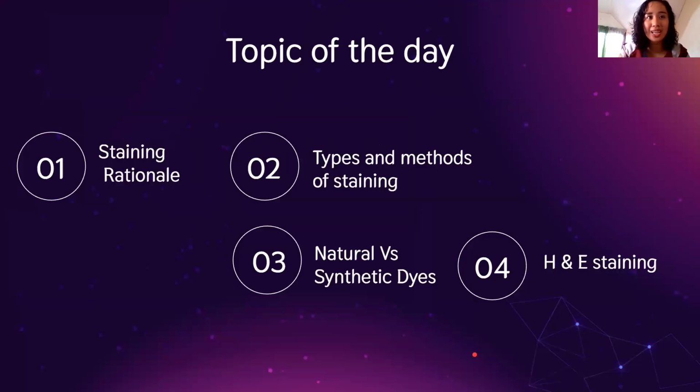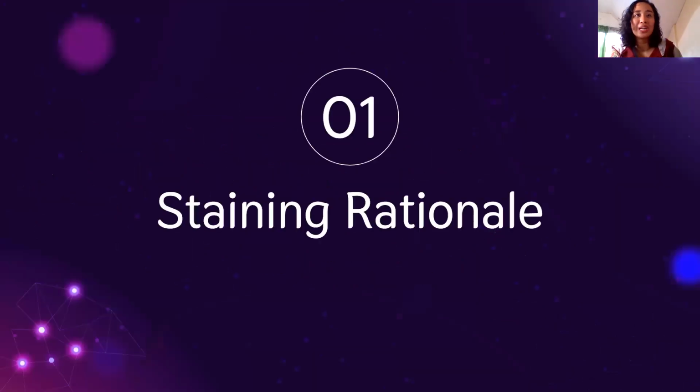So, let's brace ourselves. What is the reason for staining? Why does a tissue stain? What are the staining mechanisms, types and methods of staining, different types of dyes, and H&E staining? For the special stains, guys, we need another PowerPoint.